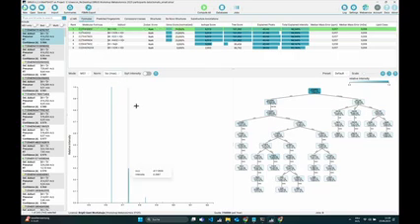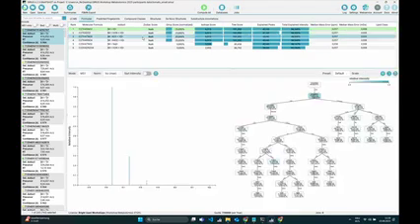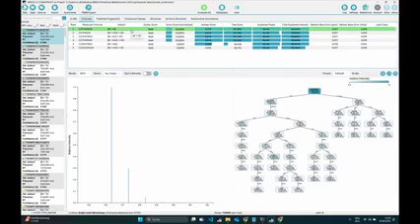So before we had any computations, we could just look at the spectra. But now we also have a list of formulas which have been identified and which are ranked according to their SIRIUS score, which is shown here in this column. And we have a fragmentation tree to each formula. Now the first thing that you would see if you would look closely at this, so the first column that you have, besides the rank of course, is the molecular formula itself.